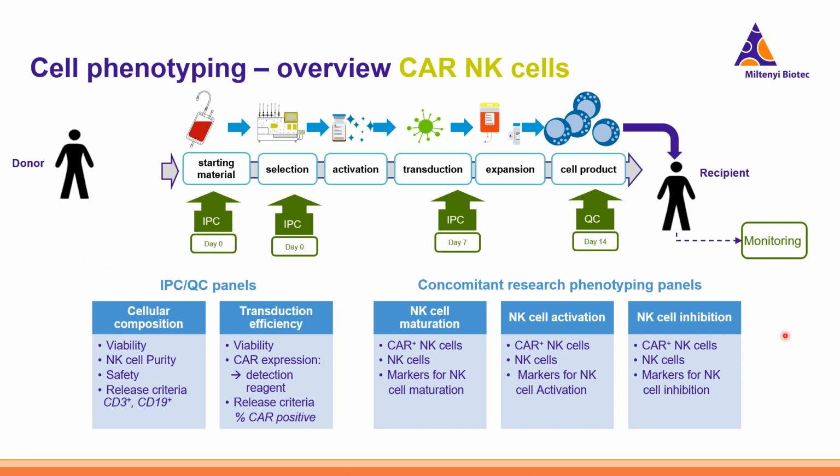We are also working on panels for the concomitant research activities. Those are panels looking at the maturation, activation, as well as inhibition status of the natural killer cells.